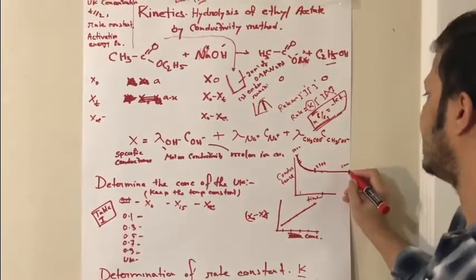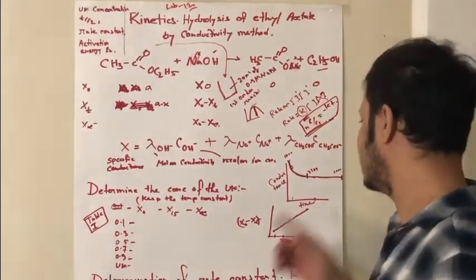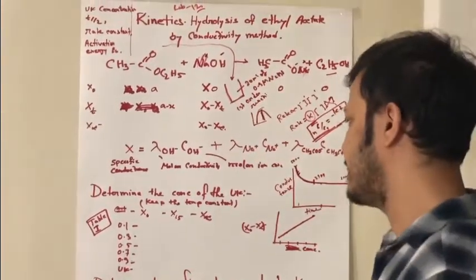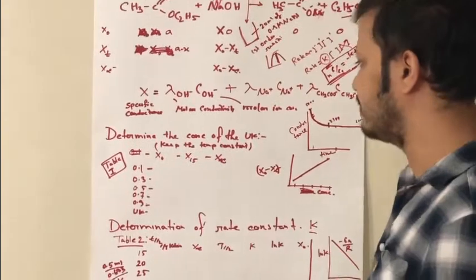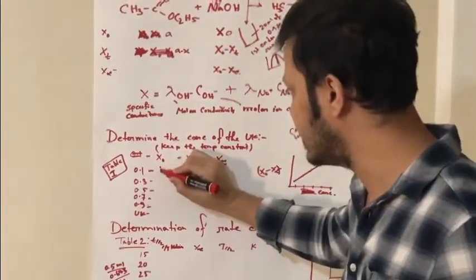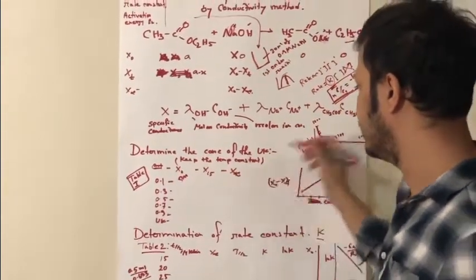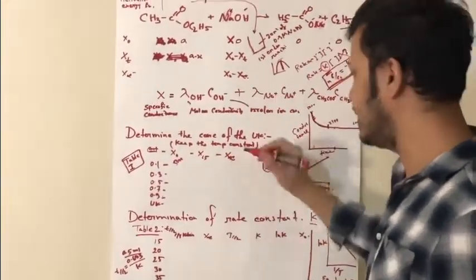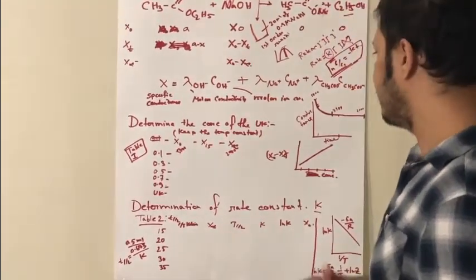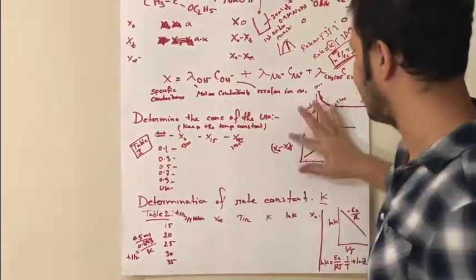After infinite time you see that the value is around 2000. That means the reaction is done, completed. So the initial value is 5000, you will get the value at t half, and after infinite time it is 2000. In the same way you will get the values for the 0.3 ml after finishing it.